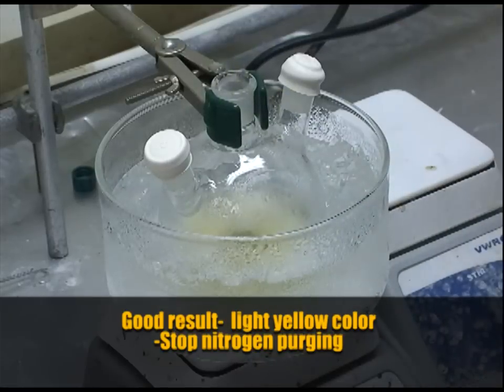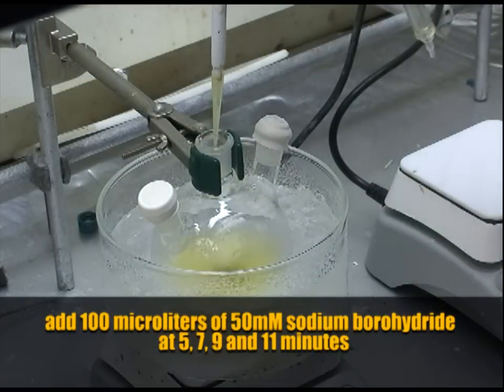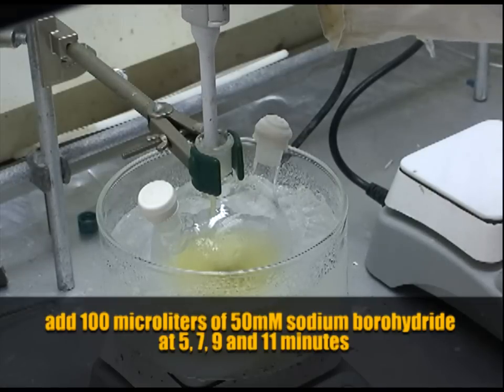After adding the borohydride we stop purging the solution. At around 5 minutes we add 100 microliters of sodium borohydride. We will repeat this step at 7, 9, and 11 minutes.